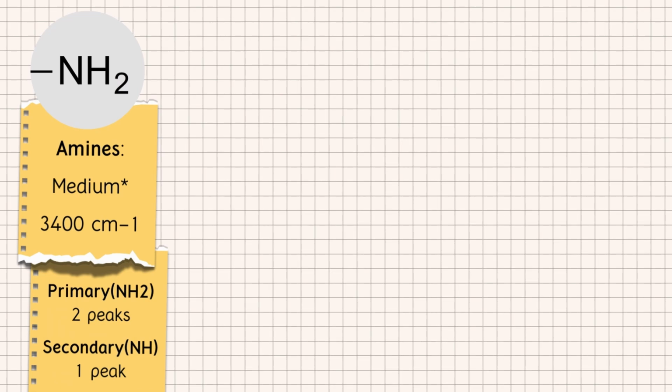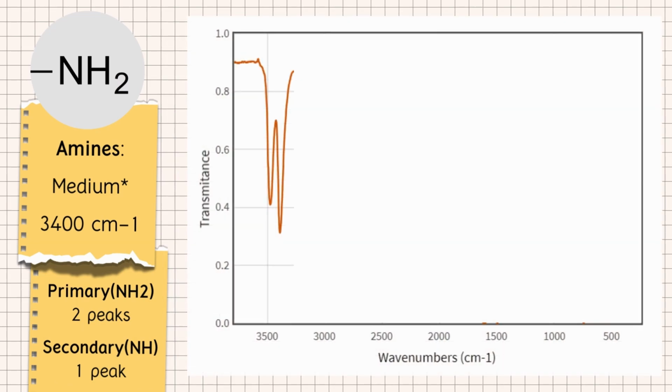So, look at the chart. Do you think this is a molecule with a primary amine or a secondary amine? Yeah, a primary. Remember, primary means 2 hydrogens. I know it can get a little confusing there, because secondary is 1, sounds kind of switched, but keep it in mind, this is an NH2 group bonded to the rest of the molecule.